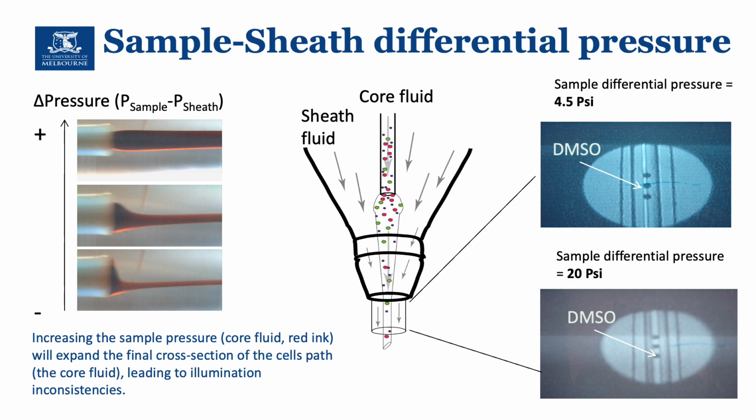And although you would like to run imaging faster by increasing the pressure, your measurements will also be a little compromised. It depends on what you are measuring as well. But my suggestion would always be to use the minimum pressure that you can afford. In the case of nanoparticles, for instance, you need to use that because it's a mandatory requirement, for things that I will explain later. But differential pressure is important. Highly precise measurements or linear measurements like DNA content, for instance, are typically measured with a low differential pressure to guarantee tight peaks and a very nice precision.